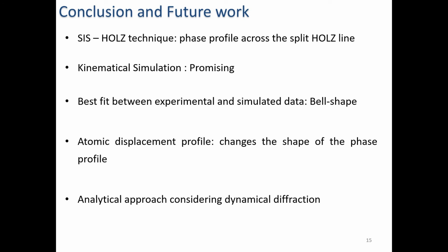In conclusion, I believe that the SIS-HOLZ technique enables measuring the atomic displacement profile through the specimen thickness by reconstructing the phase profile across the split HOLZ line. The kinematical approach for quantifying the data looks promising if the thickness satisfies the kinematical condition for the electron diffraction. The only parameter which affects the shape of the phase profile was the atomic displacement shape. This is shown in details in the paper I just introduced in previous slide.